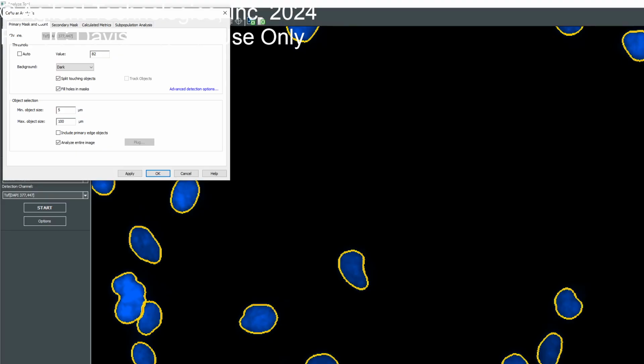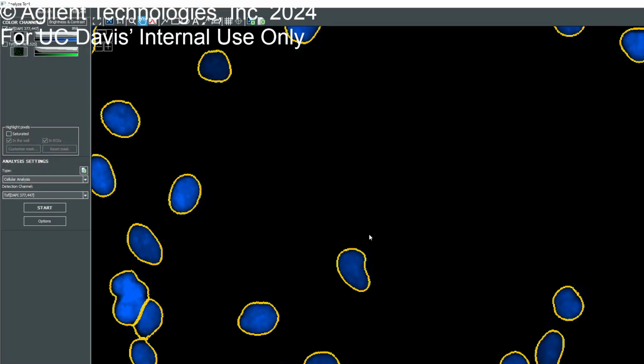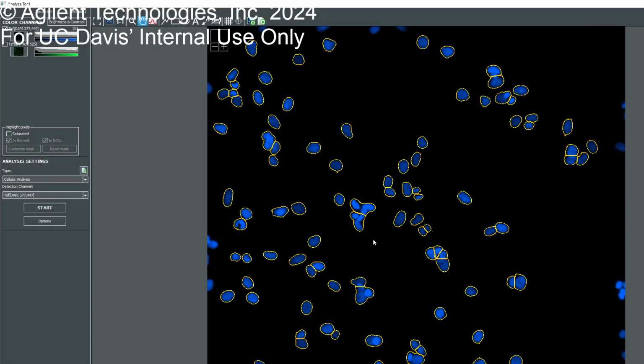So if I use 5,000, it's going to start off from a very low threshold, right? And then we have this clumping issue where we are determining these cells to be 1. Can I use your notepad just for a second? Sure. Okay. What we use is a watershed algorithm. Just to go into a little bit more detail about that.